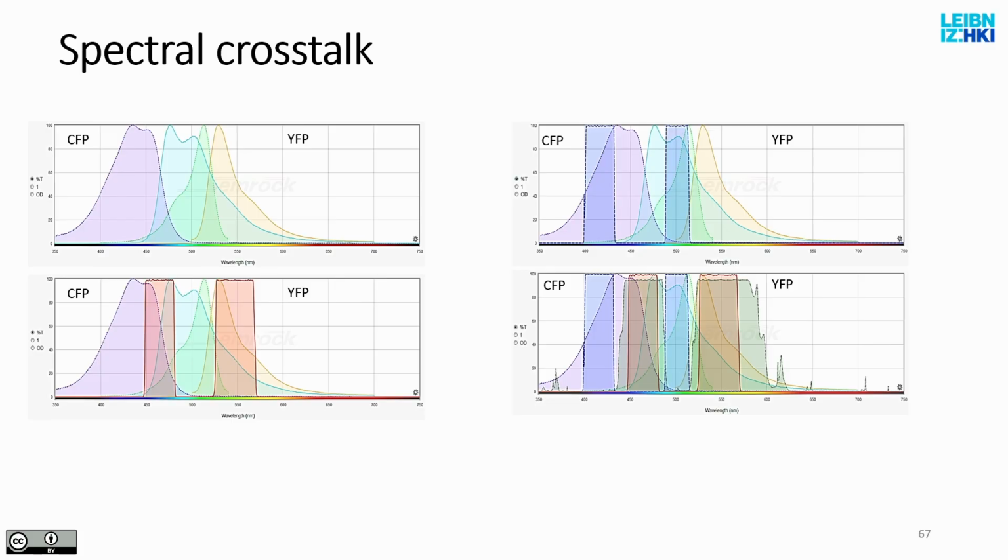And sometimes biologists will know much more about this than we do. You are limited in what color you can use. Your secondary antibodies come in certain colors, so you have to deal with the crosstalk. And then you will see an example from Ruben later, and I will also talk about it on Wednesday in advanced JIPipe.